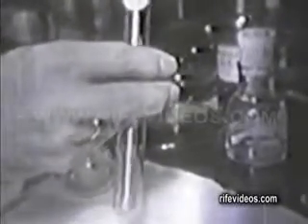The liquid material is poured into the test tube, and a drop is removed from that liquid, which Rife will shortly place on a slide which has been sterilized with flame. The liquid material is withdrawn with a micro pipette made by Rife into the solution, and a drop is placed on the slide and covered with a cover slip made of quartz. Rife used quartz slides because the light passed through better than glass.